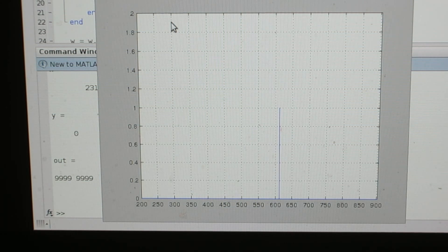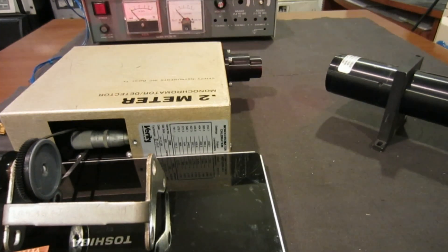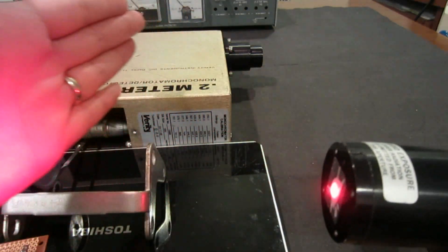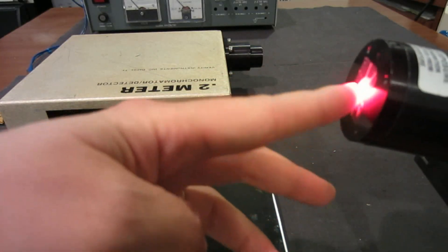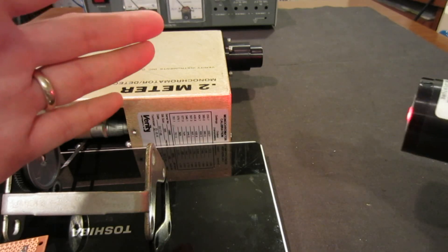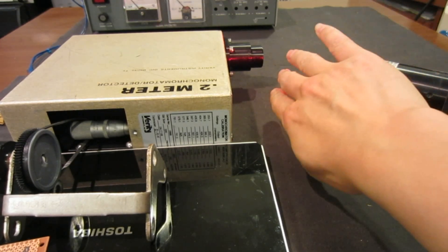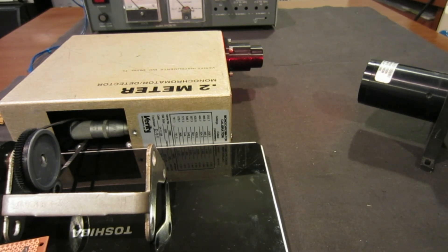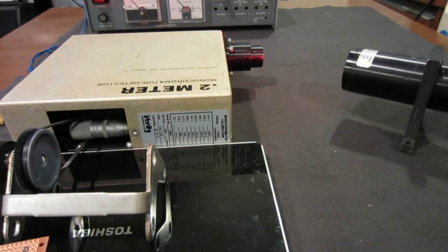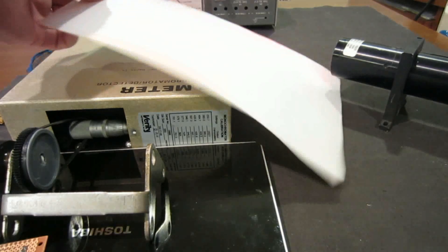Now let's take a look at some real life measurements. Here's my setup. As you can see, the power supply is back there — I haven't turned it on yet. Here is a helium neon laser, and I did a little bit of modification. I actually put a little lens in the front to make the light more uniform — instead of a dot, it's diverged. Number one, the monochromator cannot take in that high intensity input. Number two, this will make the optical field more uniform so that the measurement will be more accurate.